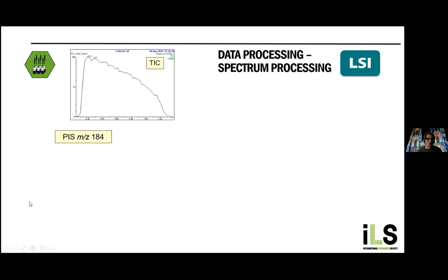We run that system, and we just combine spectra here from the TIC at half height of the injection. So it's flow injection. We inject here the sample. You see the total ion current is rising and declines, and we summarize these spectra in that window.